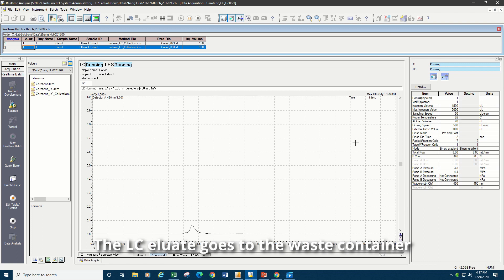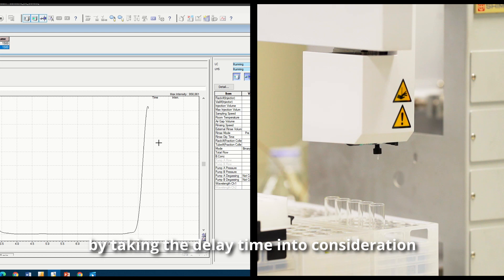The LC eluent goes to the waste container when a fraction collection signal is not triggered. Otherwise, the LC eluent goes to proper containers, such as test tubes in the rack. In this analysis, when the fraction collection signal is triggered by the level and slope, the LH40 automatically starts to collect carotene by taking the delay time into consideration.